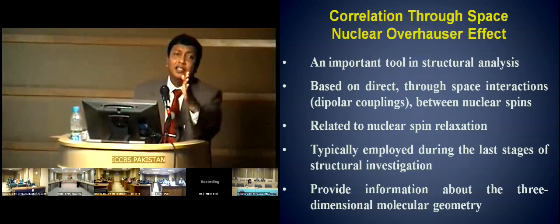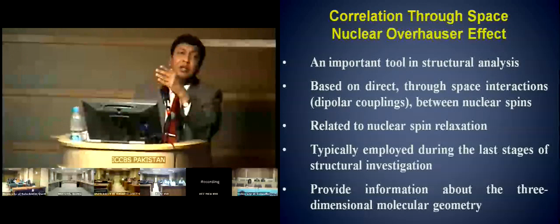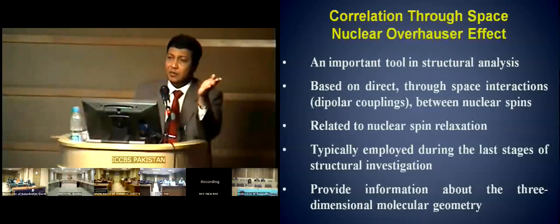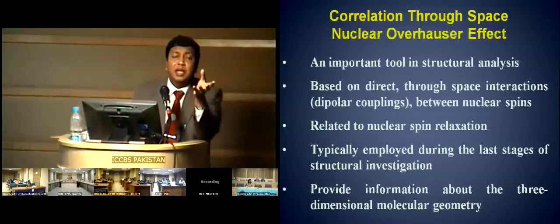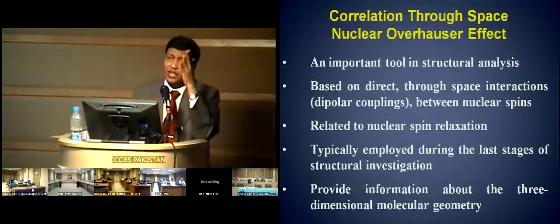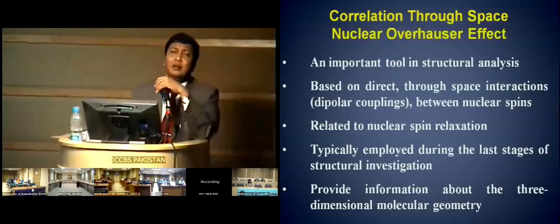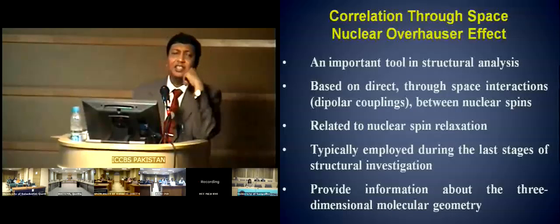The third challenge is, if your molecule is big, what are the exchanges taking place in different groups? How in the temporal dimension, with time, it is changing its form and shape. So you go to a time scale also, different NMR spectroscopy, so-called exchange spectroscopy, EXSY and other things.